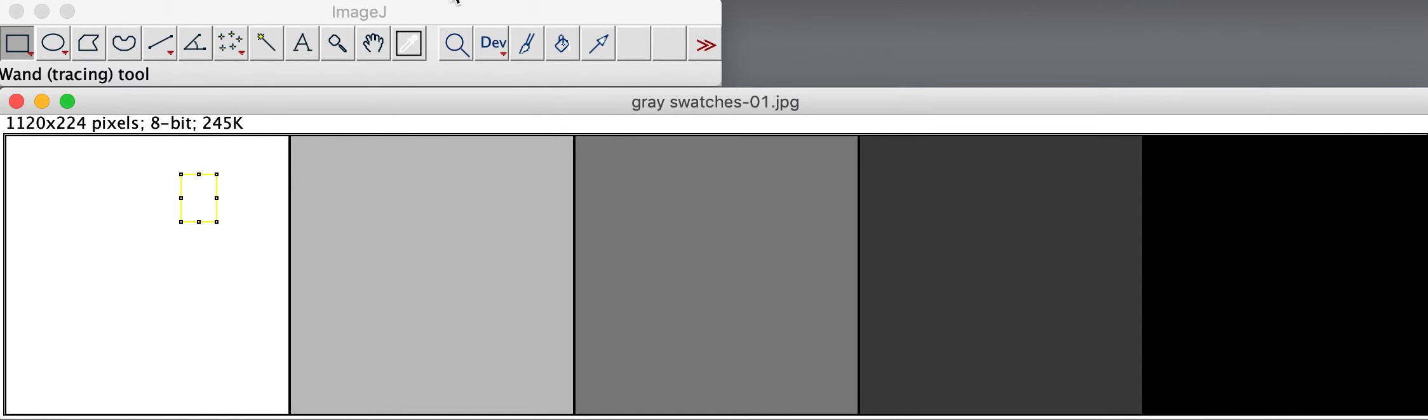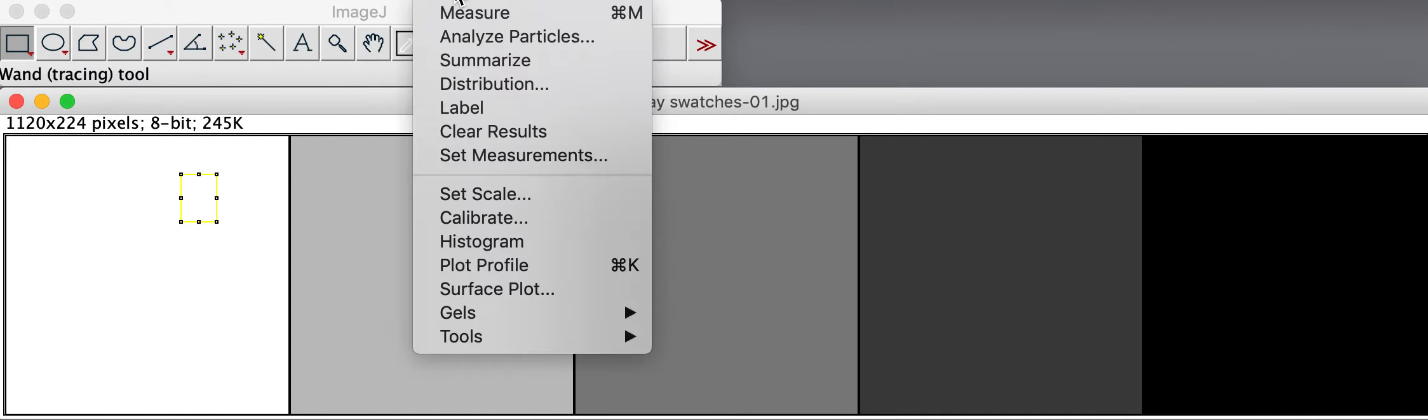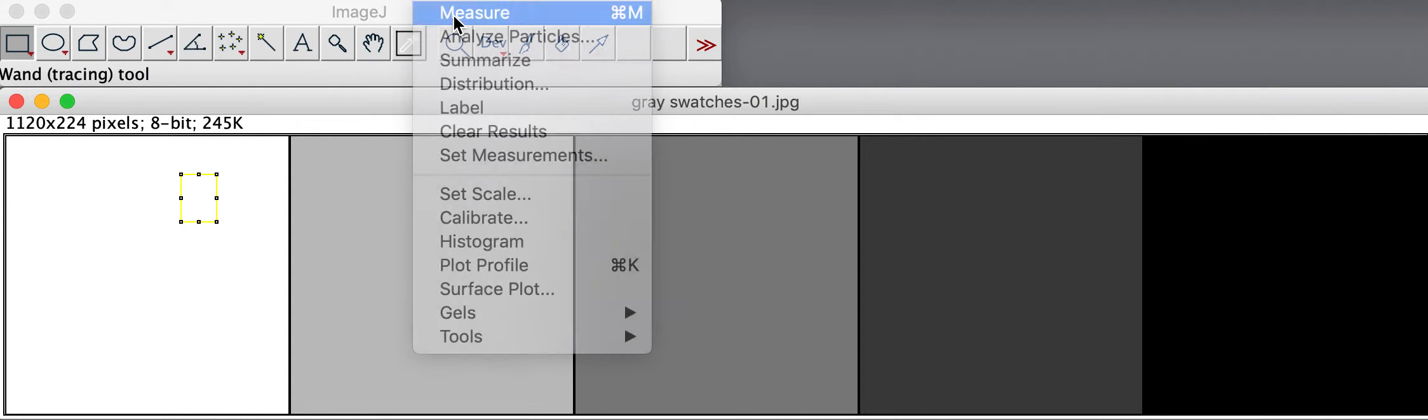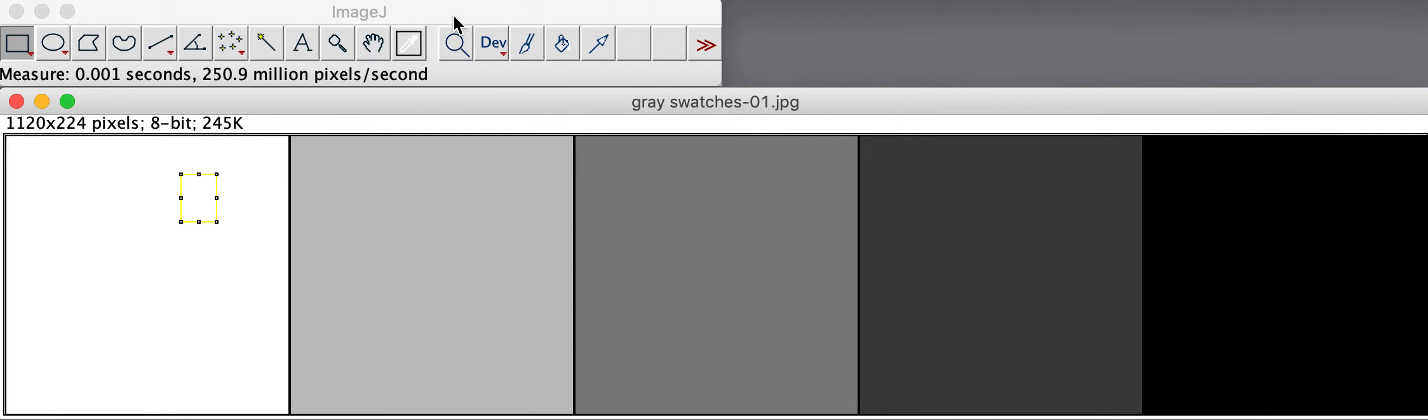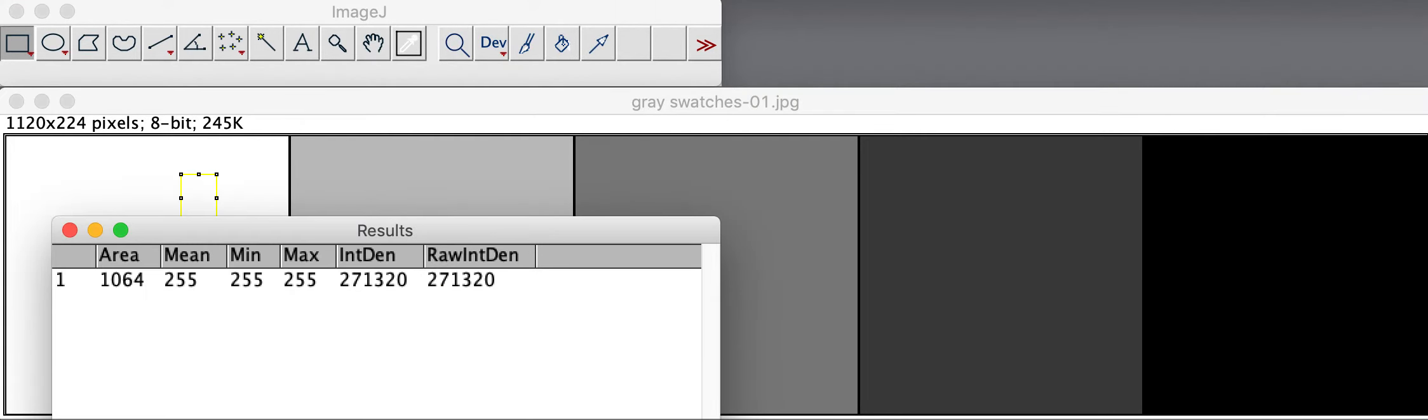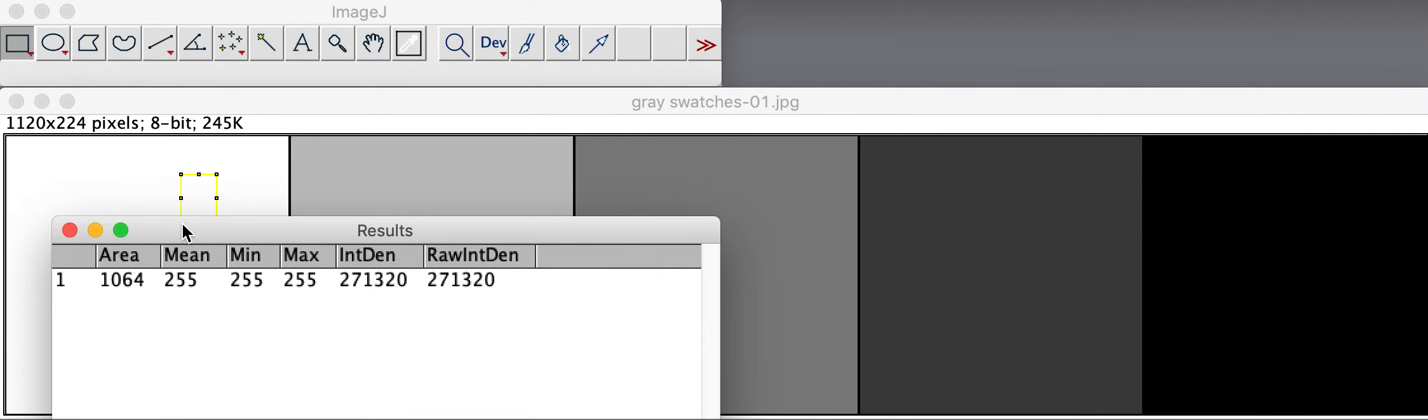Then from the Analyze menu, choose Measure, Command-M on Apple operating systems. And what that will do is open a results window that gives you different statistics about the information inside that rectangle that you drew.